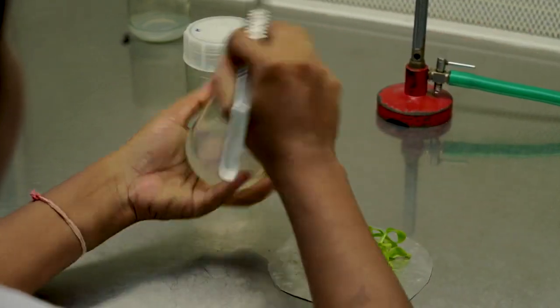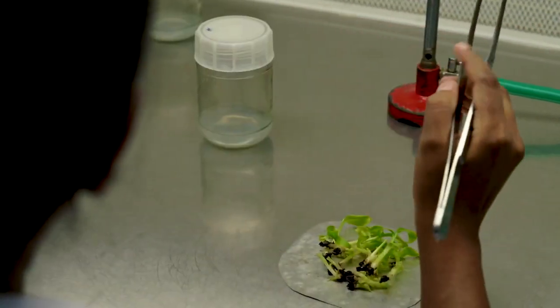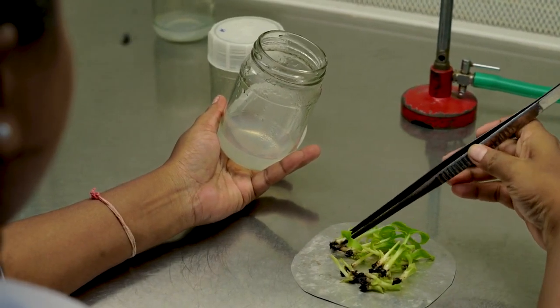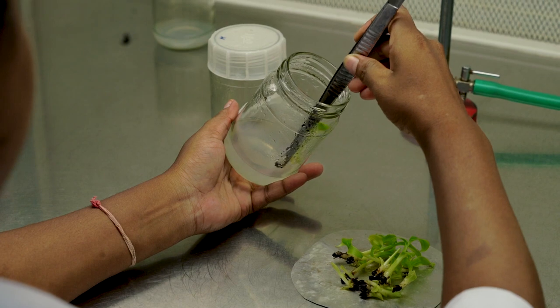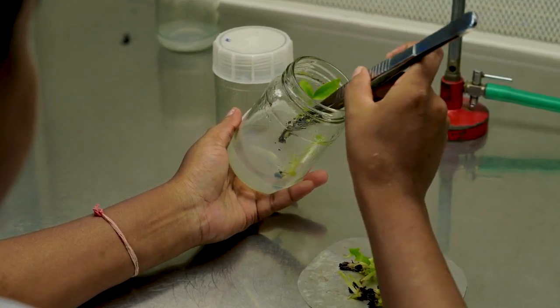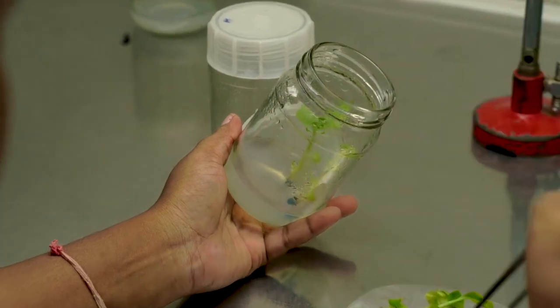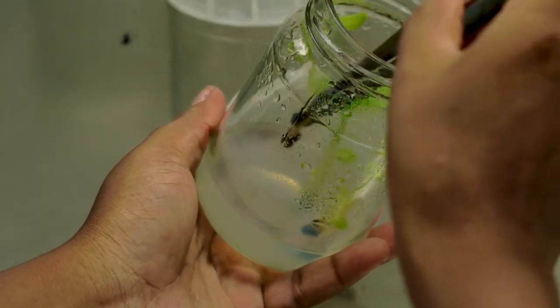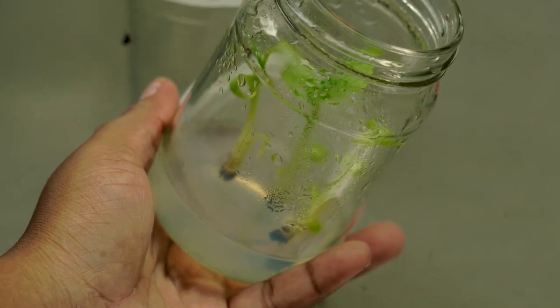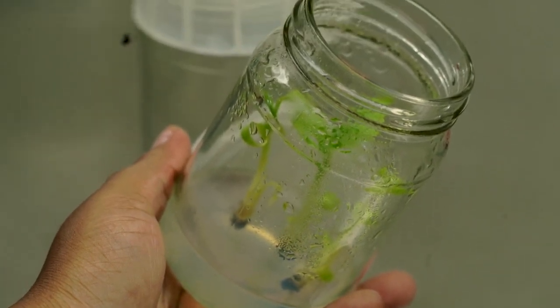The plants which are around 5 centimeter in height will be transferred into the rooting media. Rooting media helps in regeneration of the roots, whereas the micro shoots which are smaller in size will be put again into multiplication media for further regeneration.